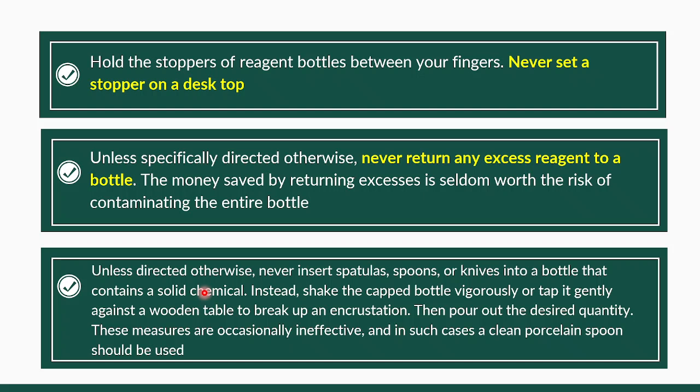So instead, if ever naay mga incrustation or kanang mga mubantok, mga mugahi na mga chemicals, atong buhaton lang ana is that we need to shake the bottle vigorously. So ato siyang uyugon og maayo or tap it gently against a wooden table to break up an incrustation.